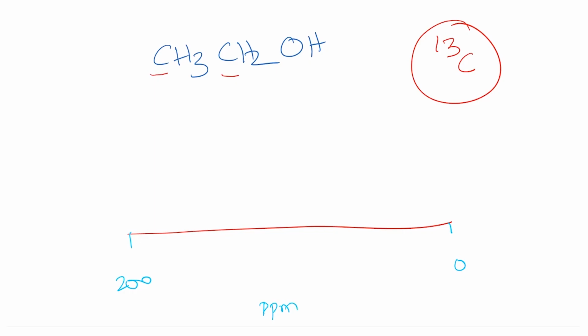And the term that is commonly used to describe this is chemical shift. Okay. So, this is the scale that is used, we will get to some of these details very soon. And what we do is, if we record the NMR spectrum of this, I am just going to draw out some numbers here so that we can understand: 20, 40, 60, 80, 100, 120 and so on.